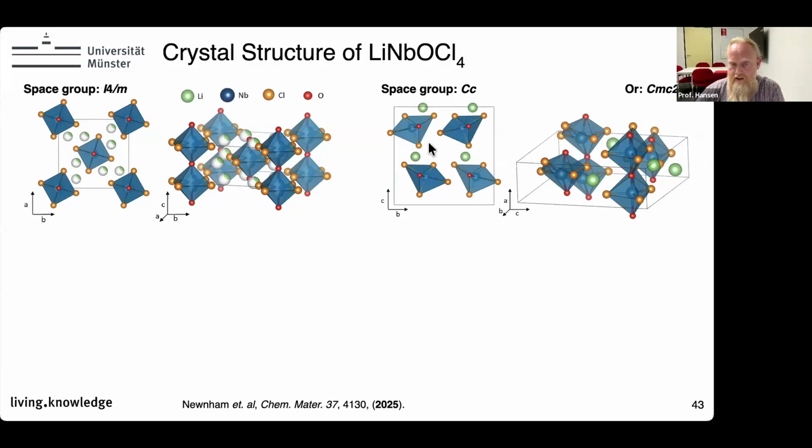Now the tetrahedra can be distorted. All niobium positions are filled here, and you get this type of structure. So it's a little bit of a debate whether it's one or the other. Maybe it's a mixture. As you see from NMR, this is something we can have a little bit of a look at. We can look at the local structures using some of the probe nuclei.